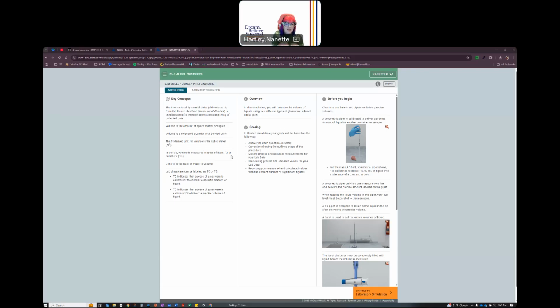will actually deliver 25. So what happens is that it takes a specific amount of liquid to wet the sides of that pipette and the end of it. There's some that gets stuck in the very end of it, and it's meant to stay there. Okay, so you're not meant to blow that portion out when you deliver that liquid. It's meant to stay there. And so because of that, you have to have that liquid stay.